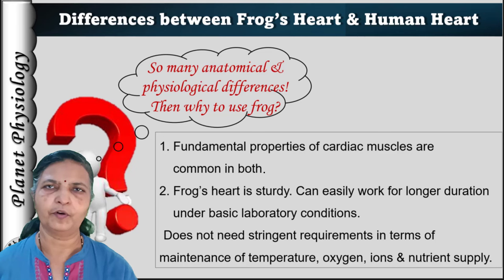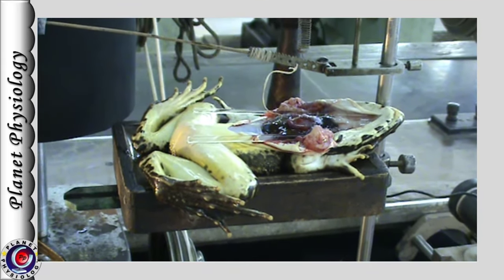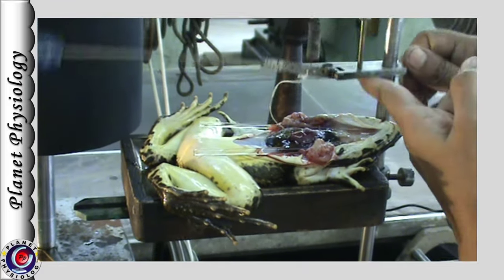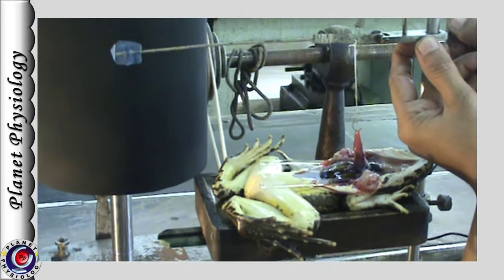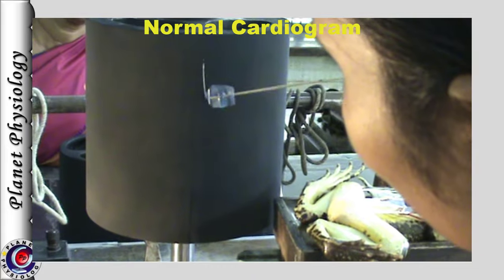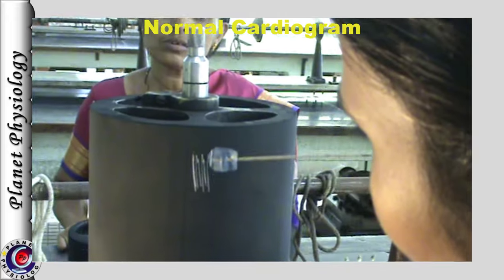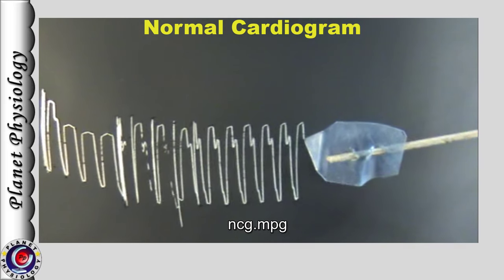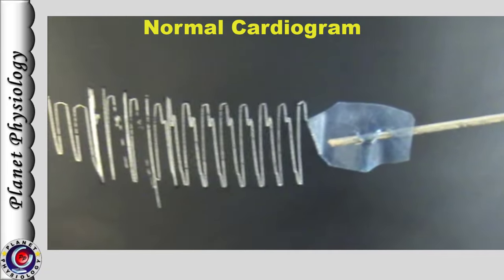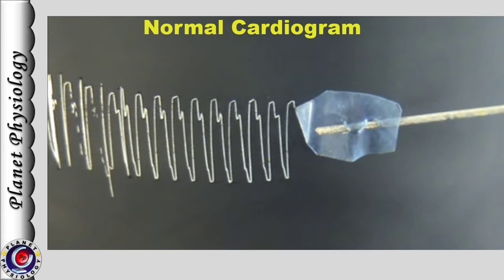Now you know the parts of the frog's heart. Let us understand the components of the normal cardiogram. To record the cardiogram, the heart lever is positioned properly and the pointer is touched lightly to the kymograph, which is set into motion. Cardiac muscle activity is recorded for sufficient duration. Every downstroke is systole and upstroke is diastole. As you can observe, systole is not a single uniform downstroke — there is a small downstroke followed by a little upstroke or a pause, and then a larger downstroke.